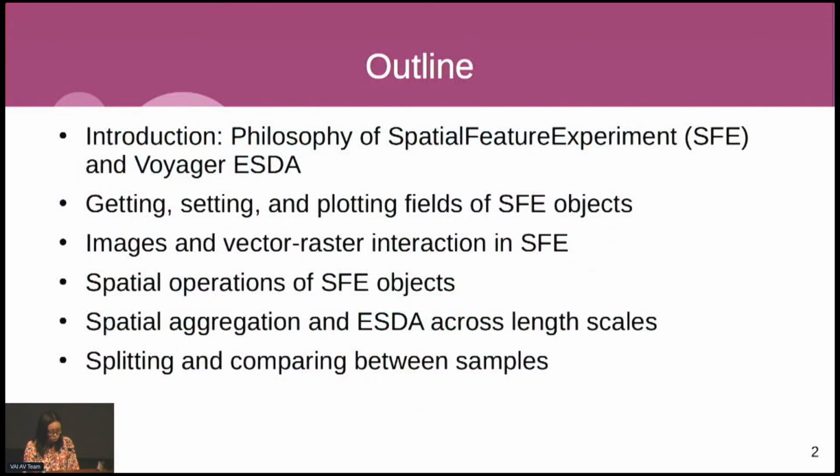I will begin with an introduction, a little bit of background about spatial transcriptomics and the philosophy of my packages, and then I will get to the new features, mostly about read functions, images, and spatial aggregation.